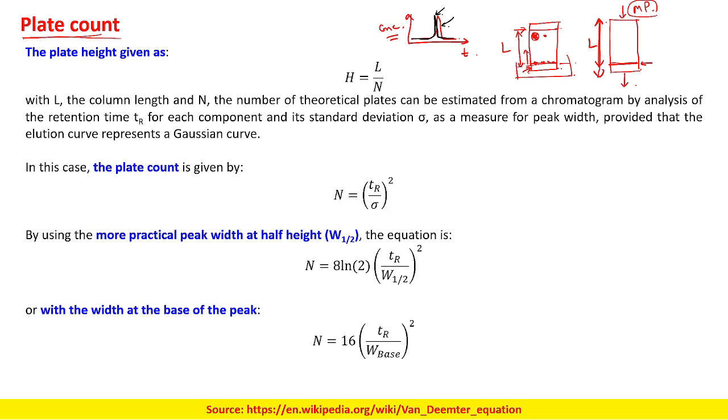What do you mean by separation? Separation means you are able to get the components or analytes in a very narrow peak, almost in one go. The components will be eluted out of the system almost in one go, or they will be present in the planar system in a very thin layer. So the separation would be better.